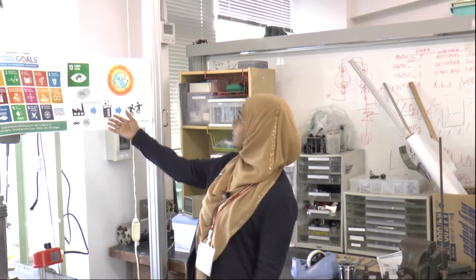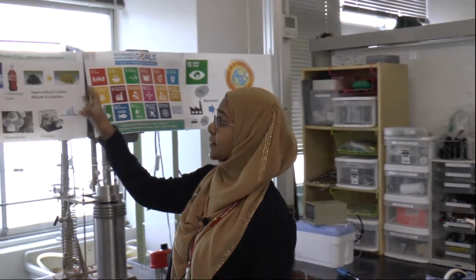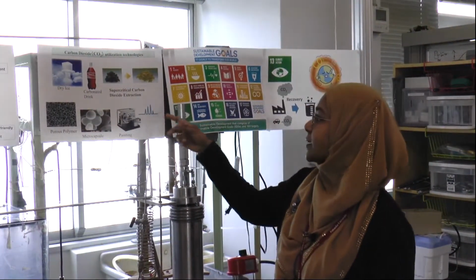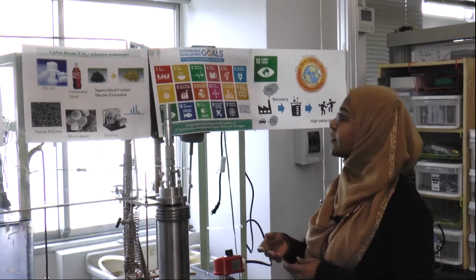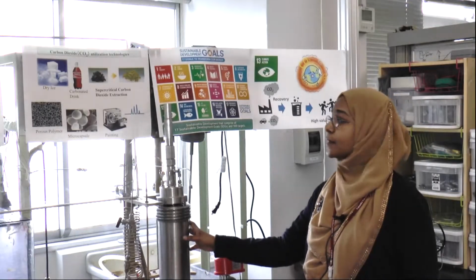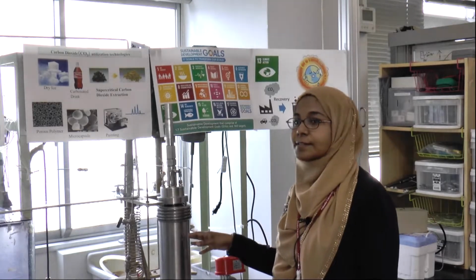So after recovered carbon dioxide, we can use it. We can find it as dry ice, carbonated drink, or we can use supercritical carbon dioxide for extraction, or using this kind of high pressure cell, we can produce microcapsule in pharmaceutical science.